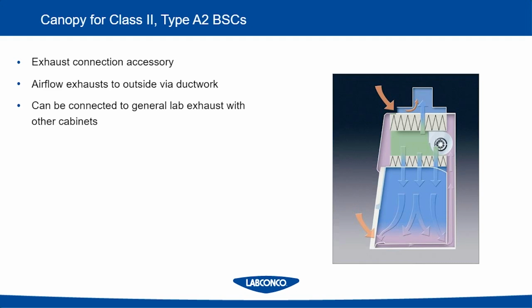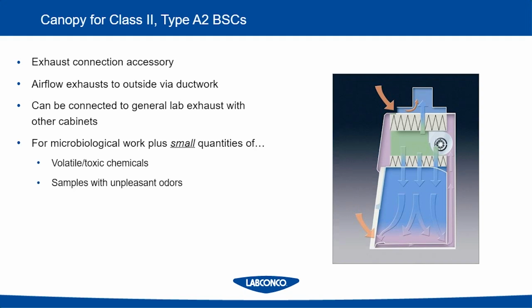What this means is that all of the air passing out of the top of the cabinet is going to be exhausted. However, if you read the BMBL, and for the reasons I previously stated, this type of setup with this canopy connection is really only good if you're using very small quantities of chemicals.